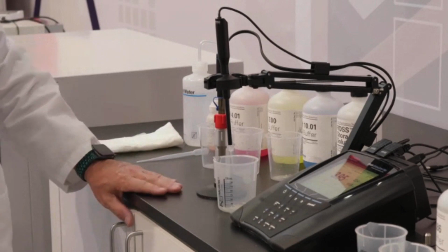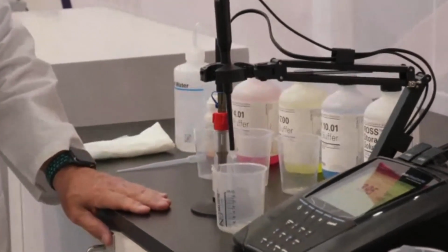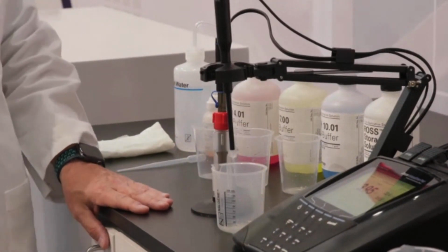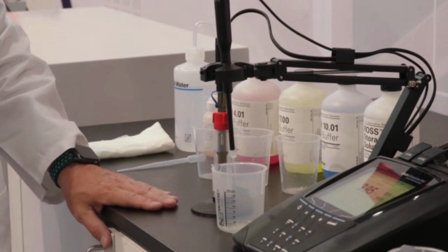All right. Hello, Steve. Here we have a complete pH setup, including the necessary solutions, storage bottles, the pH meter, and the electrode, and my lovely assistant, Steve Krynak. So Steve, let's start by examining our pH buffer bottle.